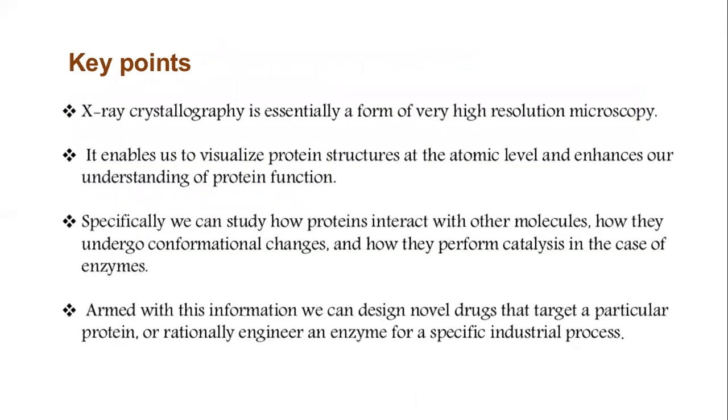So coming on to the key points to remember, X-ray crystallography is an essential technique which is a form of very high resolution microscopy which works on the X-ray diffraction pattern based on Bragg's equation, and it helps us visualize the way atoms or the unit cells are arranged within a crystal. Especially, it helps us identify how the biomolecules are constructed, the structure of the biomolecules, especially the protein structures at the atomic level, which help us understand the function of the biomolecules.